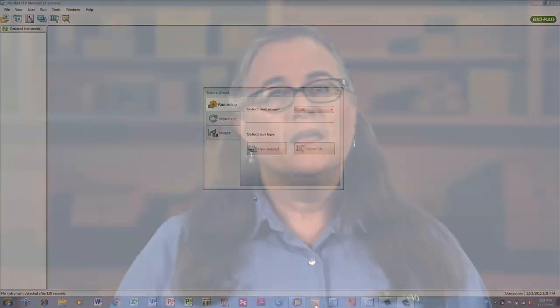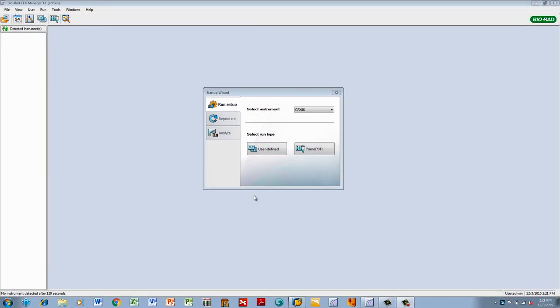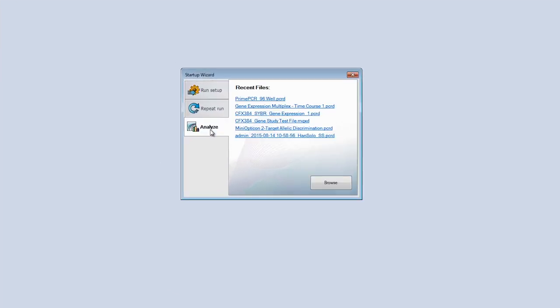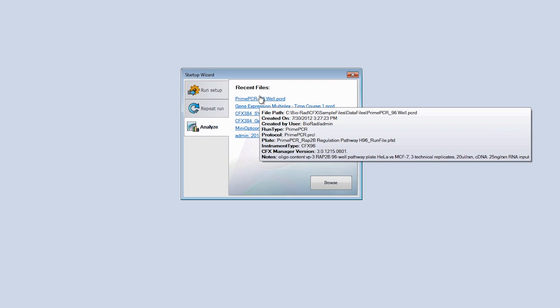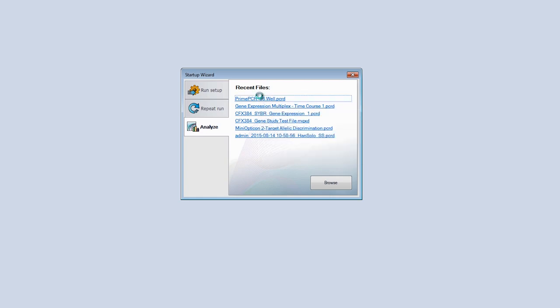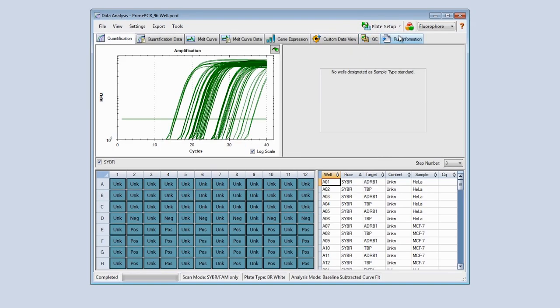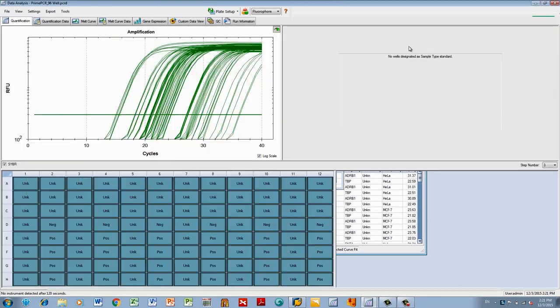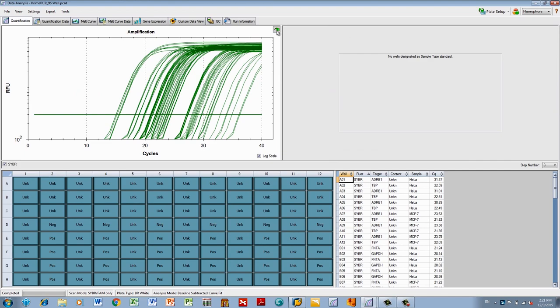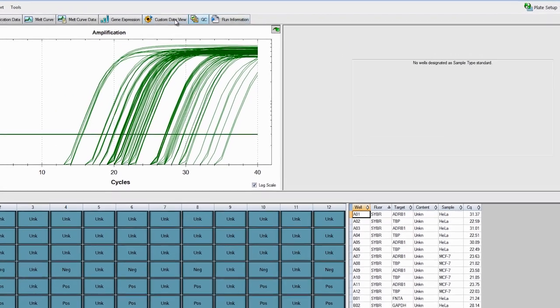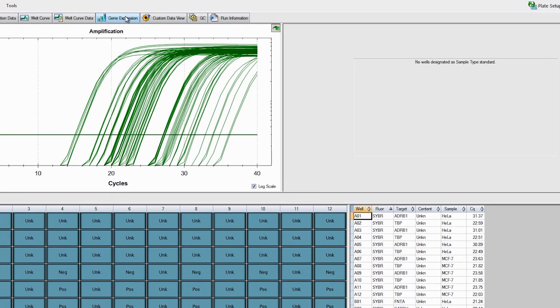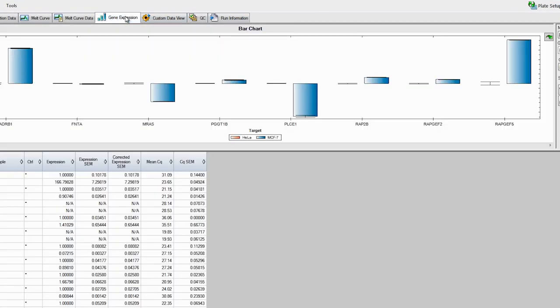So today, we're going to walk through the various ways you can analyze your data using CFX Manager software. After launching CFX Manager, navigate to data analysis by clicking Analyze and selecting your file. Here, you can see many different tabs available for analysis. To get started, click Gene Expression.